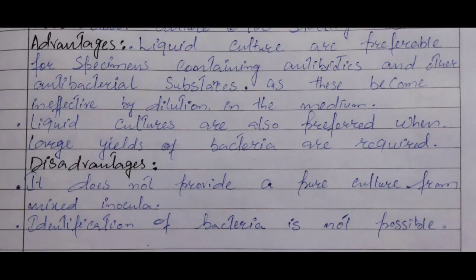अब लिक्विड कल्चर की एडवांटेज देखेंगे. लिक्विड कल्चर is preferable for specimens containing antibiotics and other antibacterial substances as these become ineffective by dilution in the medium. Liquid cultures are also preferred when large yields of bacteria are required. Disadvantage देखेंगे. It does not provide a pure culture from mixed inocula. Identification of bacteria is not possible.